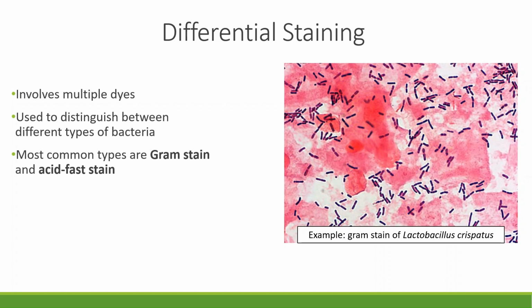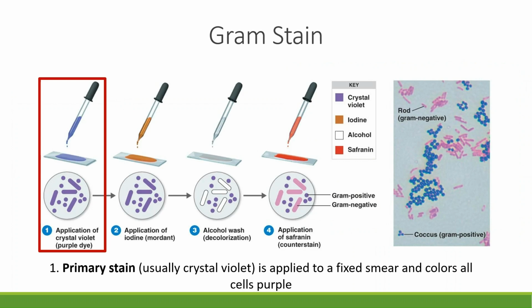And make sure you're always capitalizing the G in Gram stain. This is out of the textbook here, but this stain is named after a person, and so it should be capitalized. Again, the Gram stain is by far the most common stain used in microbiology. You will need to memorize each and every step in the staining process.